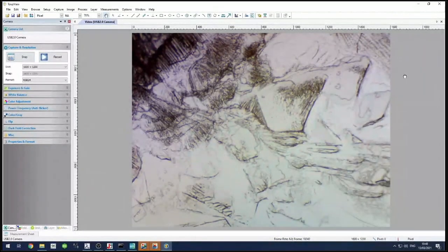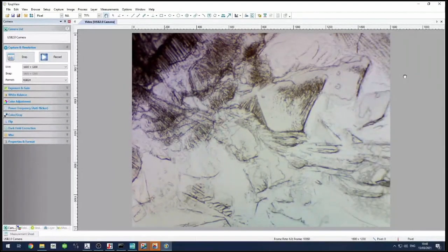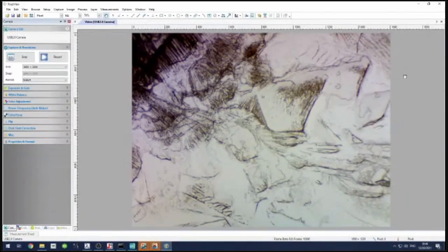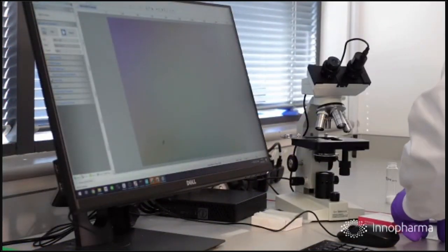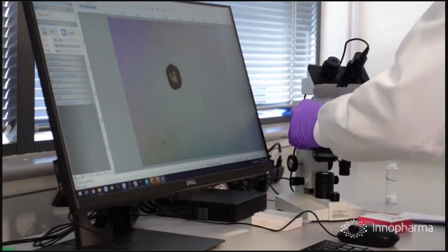This is what it looks like when crystals are allowed to form in an uncontrolled way. The crystals cascade out of the solution at lots of different sizes and across different size lengths. This is not what we're looking for when it comes to pharmaceuticals. We want our crystals to have all of the same shape, all of the same size, and to be ultra pure. If I switch to another slide, here's one I prepared earlier. On this slide, you'll see the result of controlling the temperature, not just allowing it to cool rapidly to room temperature.